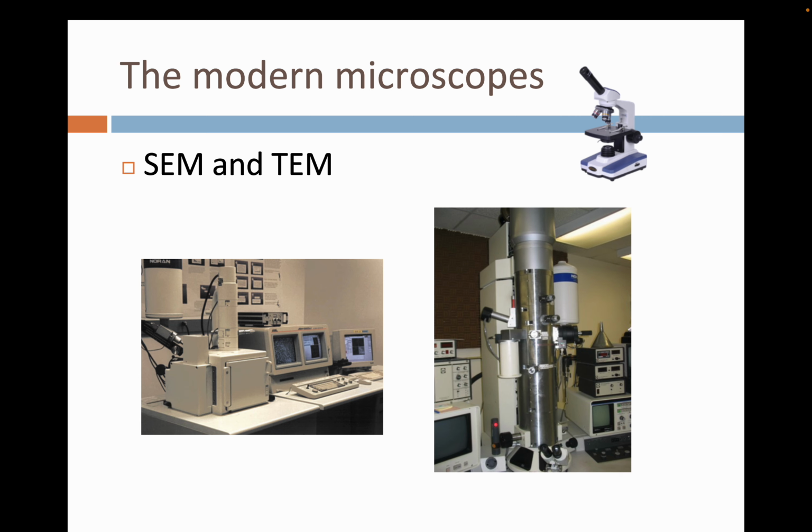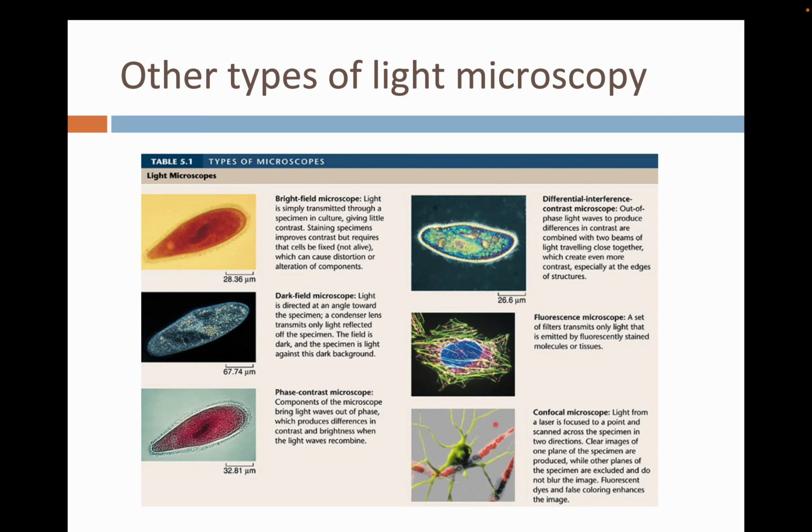On the other hand, the transmission electron microscope is used to see the super small, very, very minute objects, I mean subcellular structures. Most of the time, we use TEM to visualize subcellular structures like the organelles that are already too small to be resolved by our simple compound light microscope.